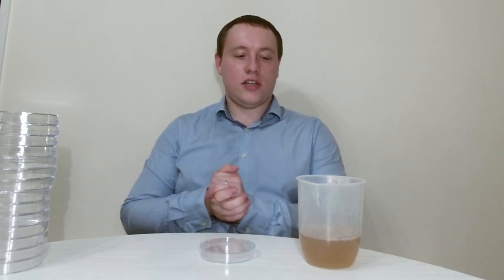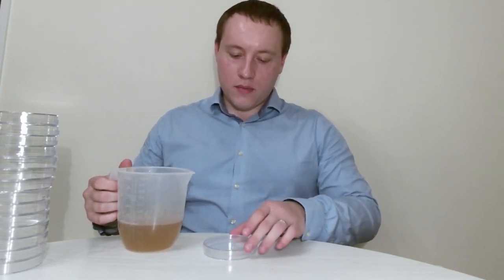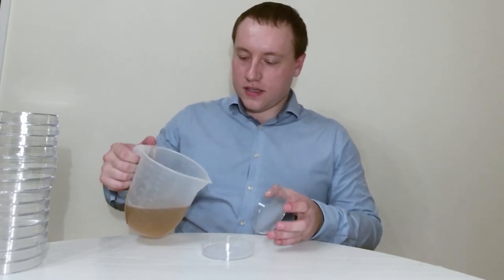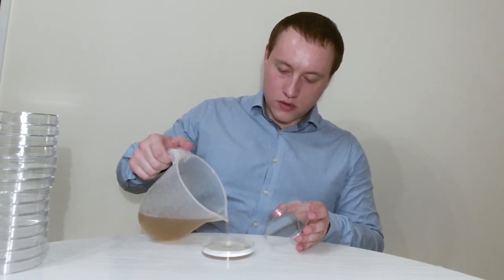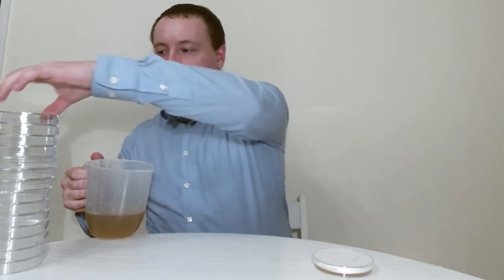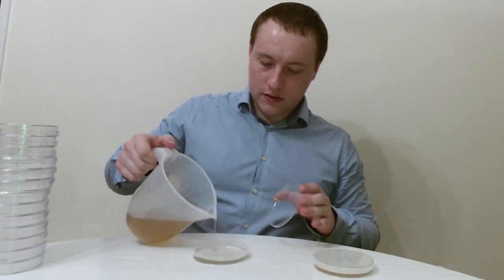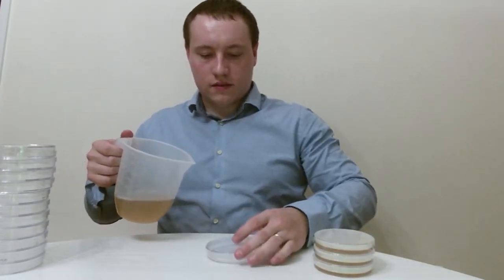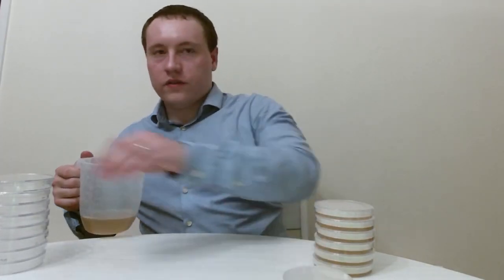If the mixture solidifies before you finish, you can always reheat it in the microwave — just keep an eye on it, make sure it doesn't over-boil, and top up with water to maintain the correct concentration. To make one of these plates, all you need to do is take off the lid, gently pour a little bit of the liquid into it, try to get as few bubbles as possible, just so it completely covers the bottom of the plate. Repeat for all the other plates. After you've poured all of them, put them in the fridge for about an hour to cool down and solidify, and then they'll be ready to use.